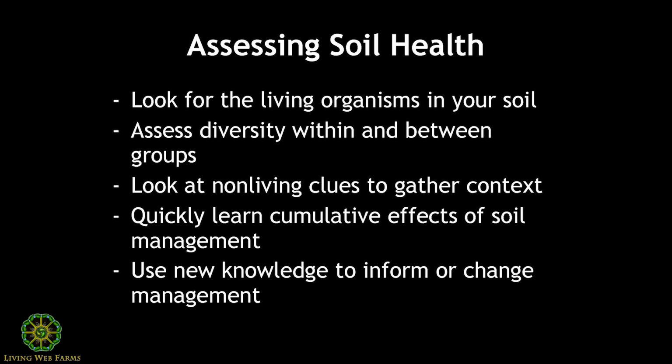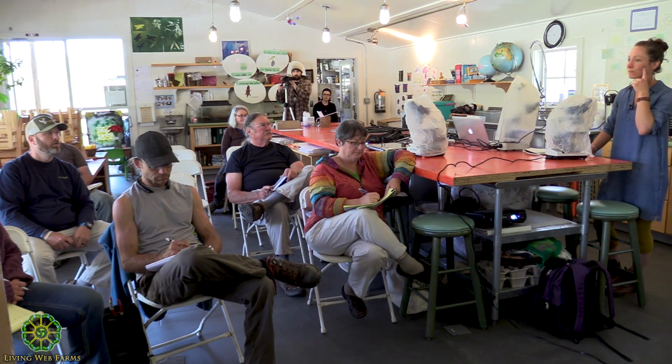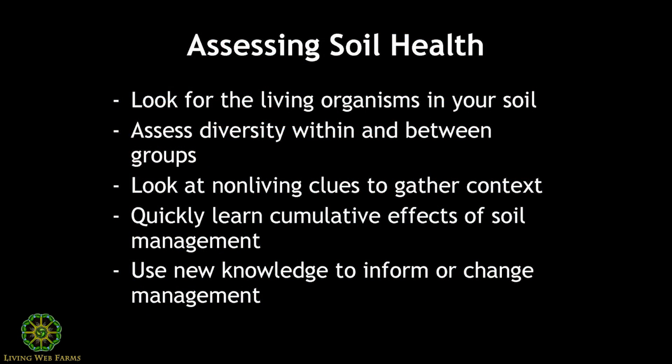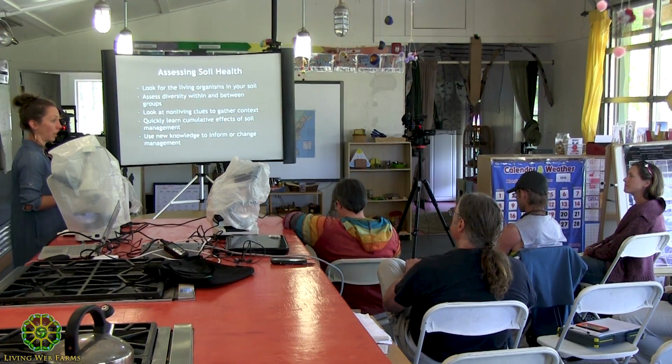We're gonna quickly be able to see the cumulative effects of soil management. So I don't know how each one of you manage your soil, but based on what I tell you, when you look through that scope, you might be able to say, I till too much, or something like that. So you'll have some really good visual cues that allow you to see how your management's affecting soil life. And then hopefully you'll use your new knowledge to think about ways to change.